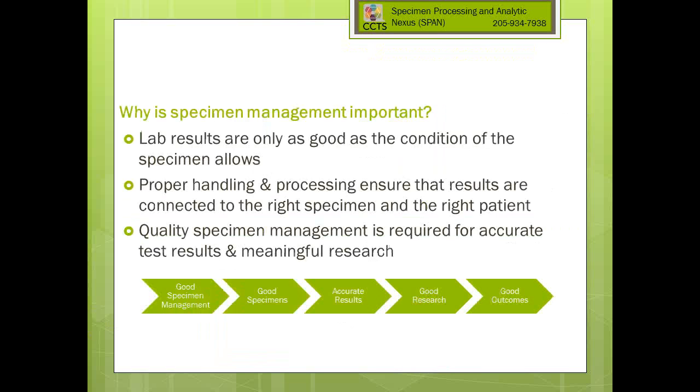So why is all this important? I hope it should be obvious that the results are only going to be as good as the conditions that the specimens are collected under. And if you don't collect the specimens the right way, you're not going to get the right result or a proper result. Proper handling and processing is necessary to ensure that the right specimen from the right patient is recorded and that information is useful for your research.